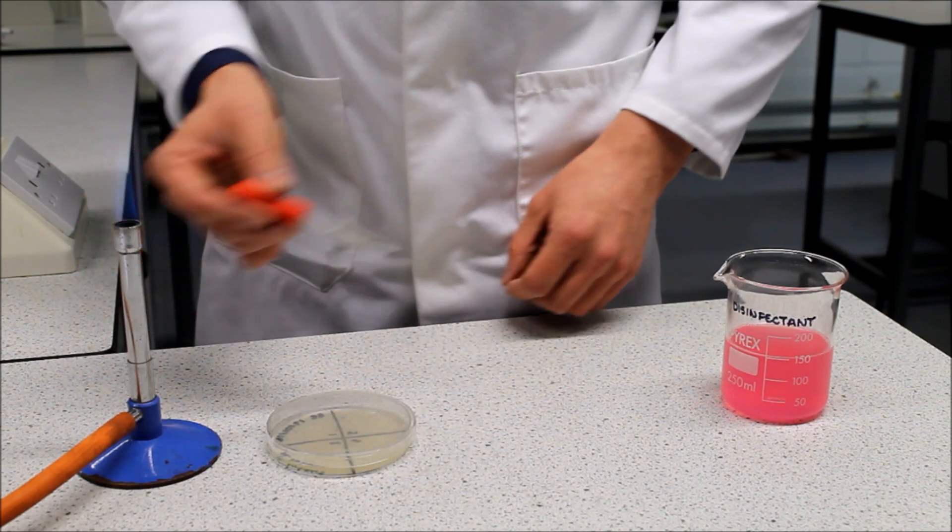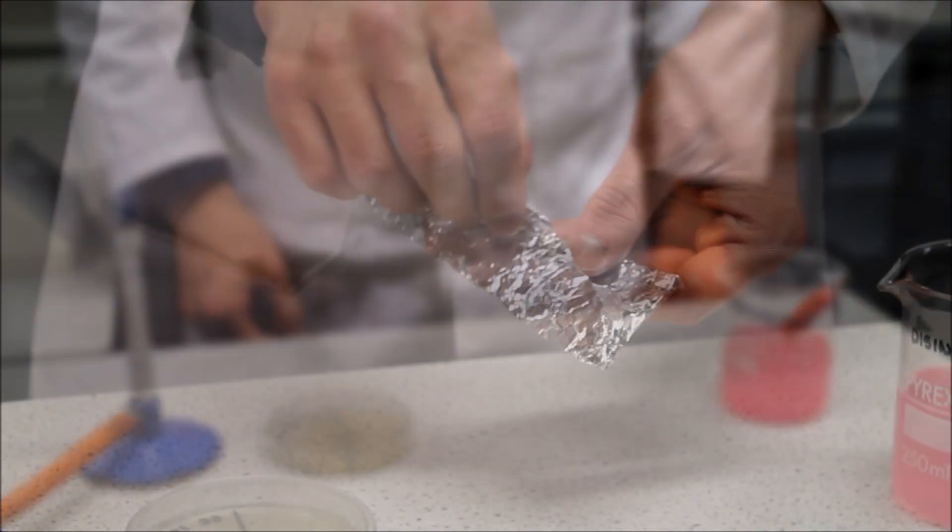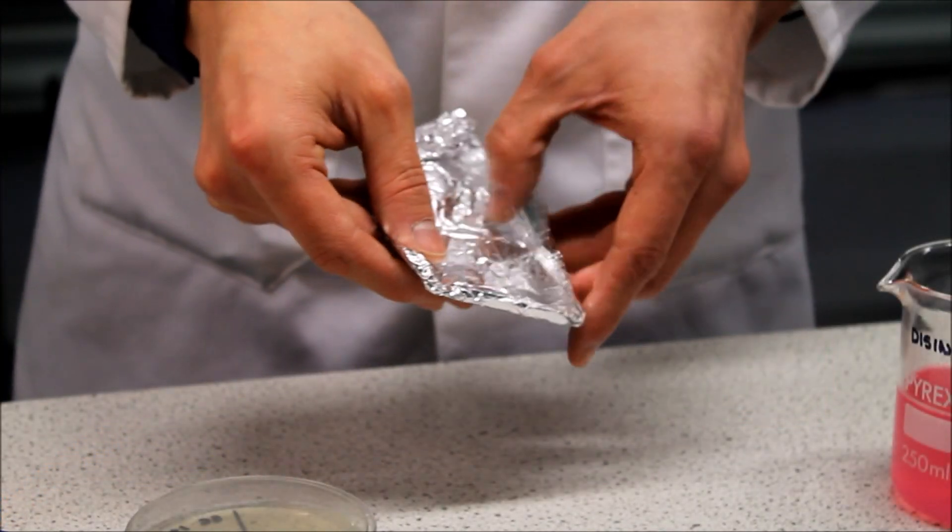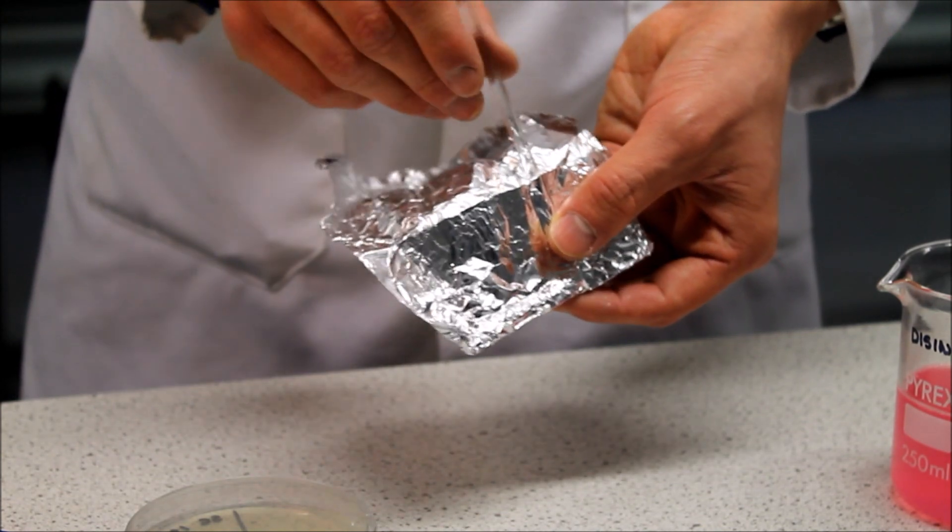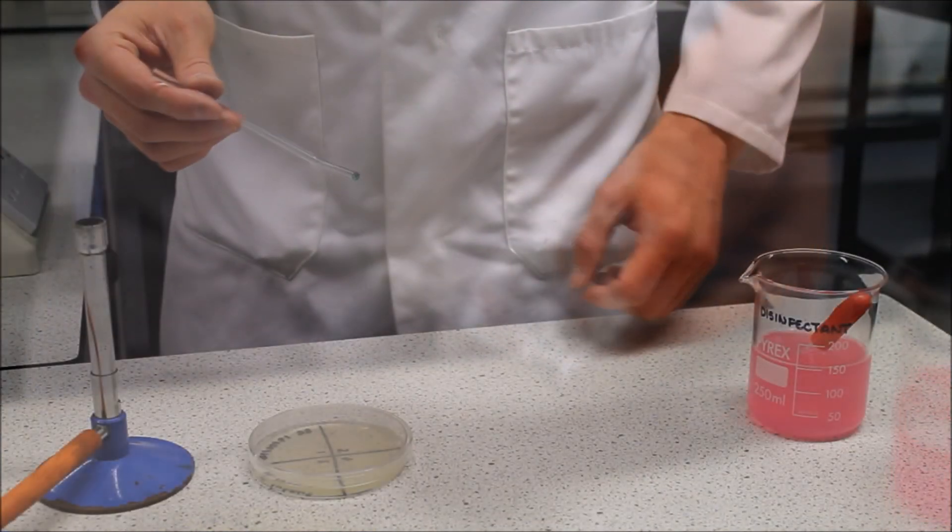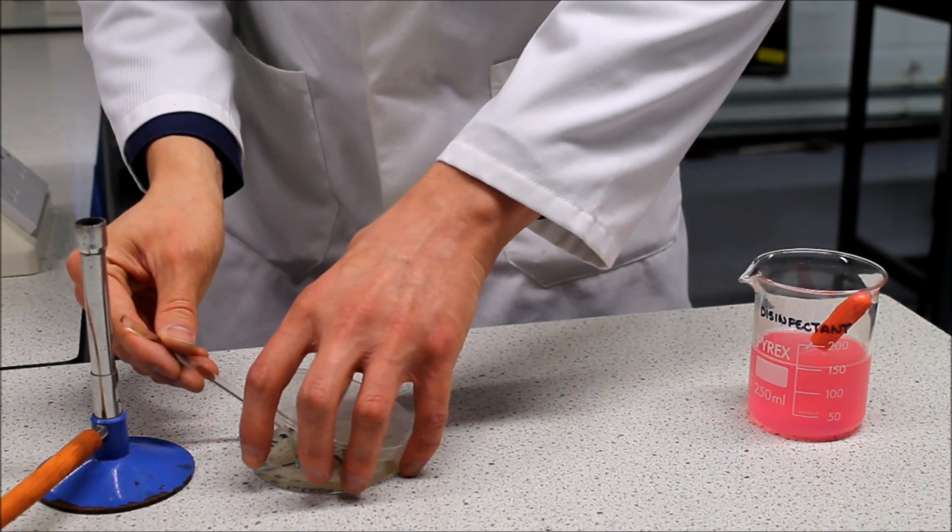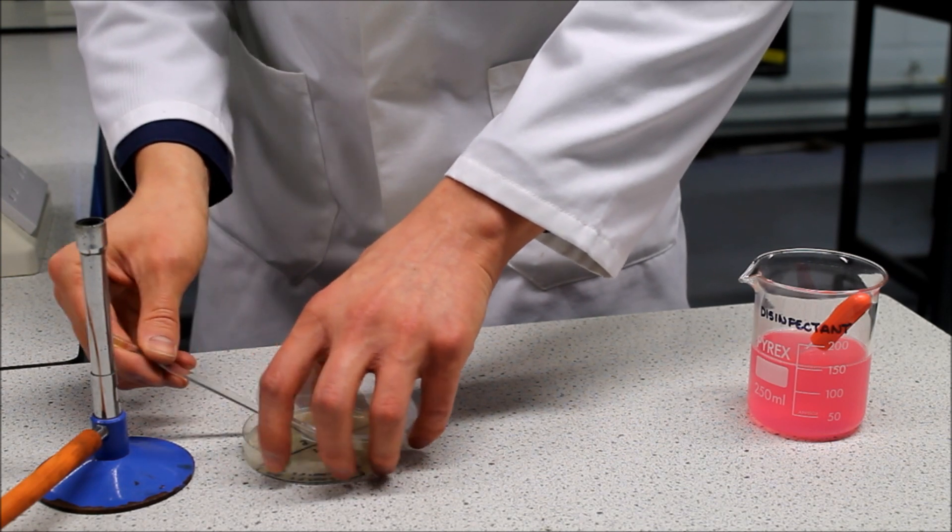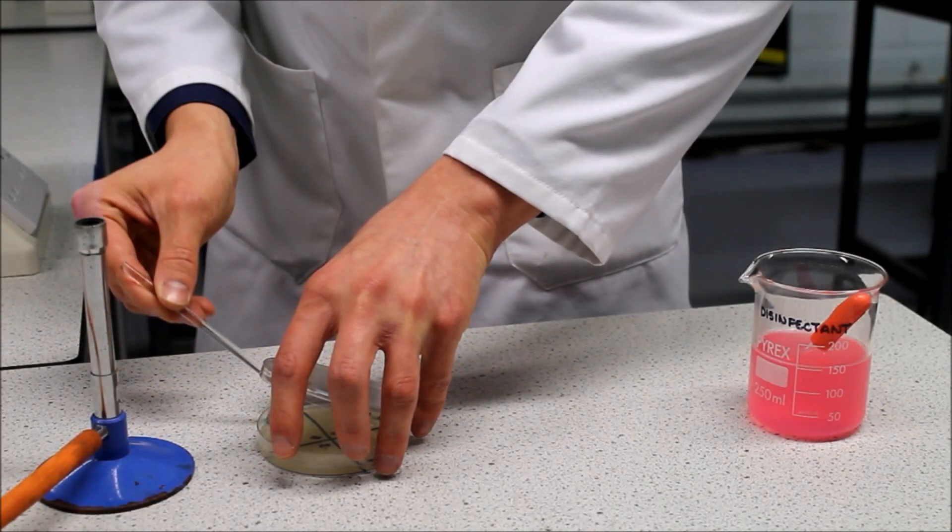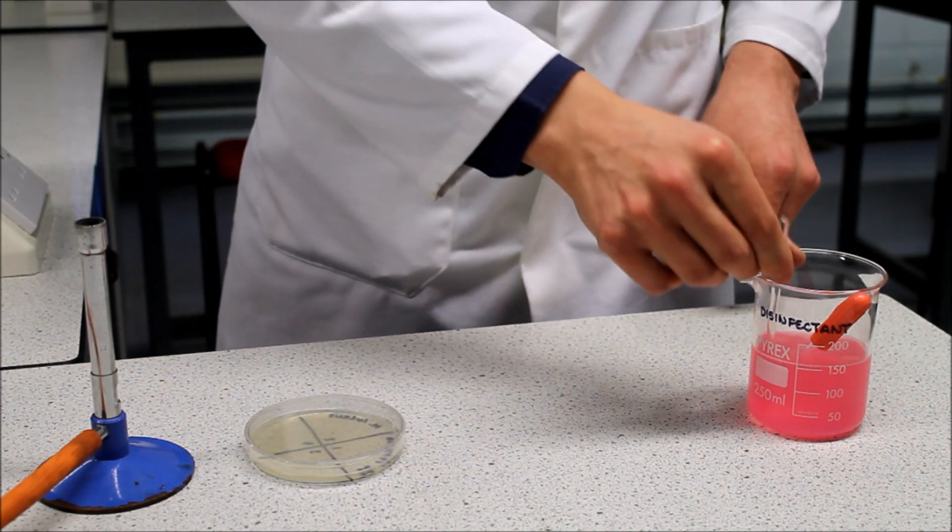Safely dispose of the pipette by placing it into the beaker of disinfectant. Carefully unwrap the spreader but only touch the handle and do not put it down as this will contaminate it. Again slightly lift the lid of the agar plate at the side nearest the Bunsen burner and spread the bacterial culture all over the surface of the agar using the spreader. Replace the lid and safely dispose of the spreader by putting it into the beaker of disinfectant.